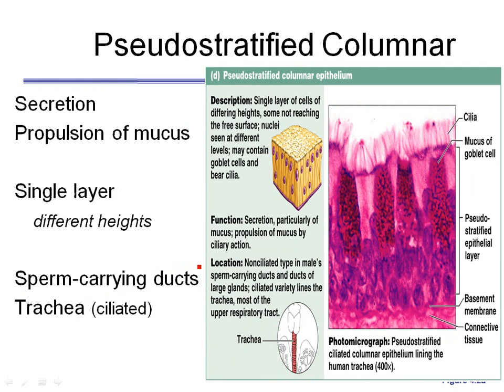And now, pseudostratified columnar epithelia. Again, we go to where the basement membrane is, right down here, and then count nuclei all the way to the apical surface. Well, if you do that, it looks like there's 5 or 6 layers of nuclei here, so 5 or 6 layers of cells. However, in reality, the cells are different heights, and every cell is in contact with the basement membrane for the most part. So that means it's really one layer, but it looked like it was 2.